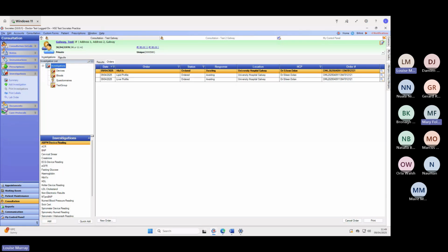Is there anything, Mary, that you feel we need to add that people who have missed it might want to know? I suppose just from the changes in logistics, maybe Nuala can clarify bags and all of that kind of stuff from a lab perspective. Yeah, we will be providing specimen bags that will be suitable for these orders. We'll go through those as we roll out with the pilot phase. So we'll have specific bags that will facilitate the order sheet and the samples coming in via order comms.